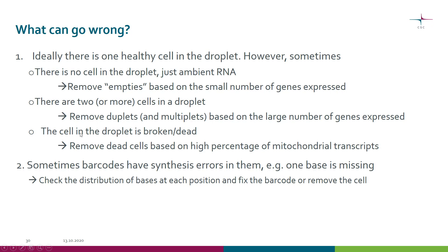It can also happen that the cell in the droplet is broken or even dead. We detect this by checking the percentage of mitochondrial transcripts — if it is high, the cell was likely not healthy. When a cell is broken, normal RNA can be degraded, but mitochondria resist better so mitochondrial transcripts survive, giving a high percentage. In the case of DropSeq, there can also be synthesis errors in the barcodes, but those can be detected and fixed to a certain extent.